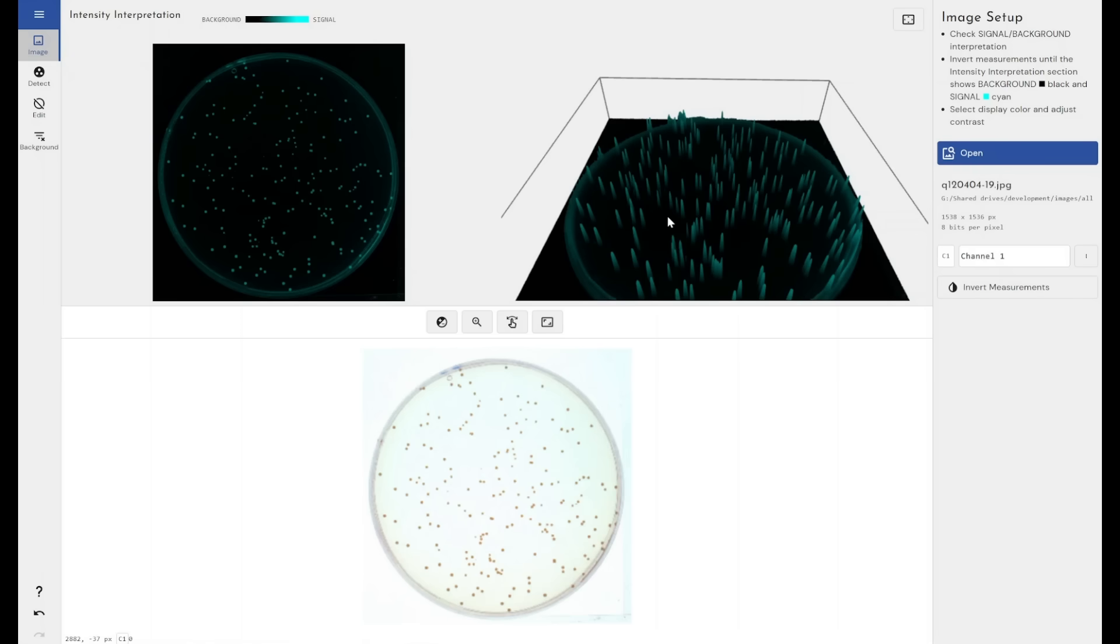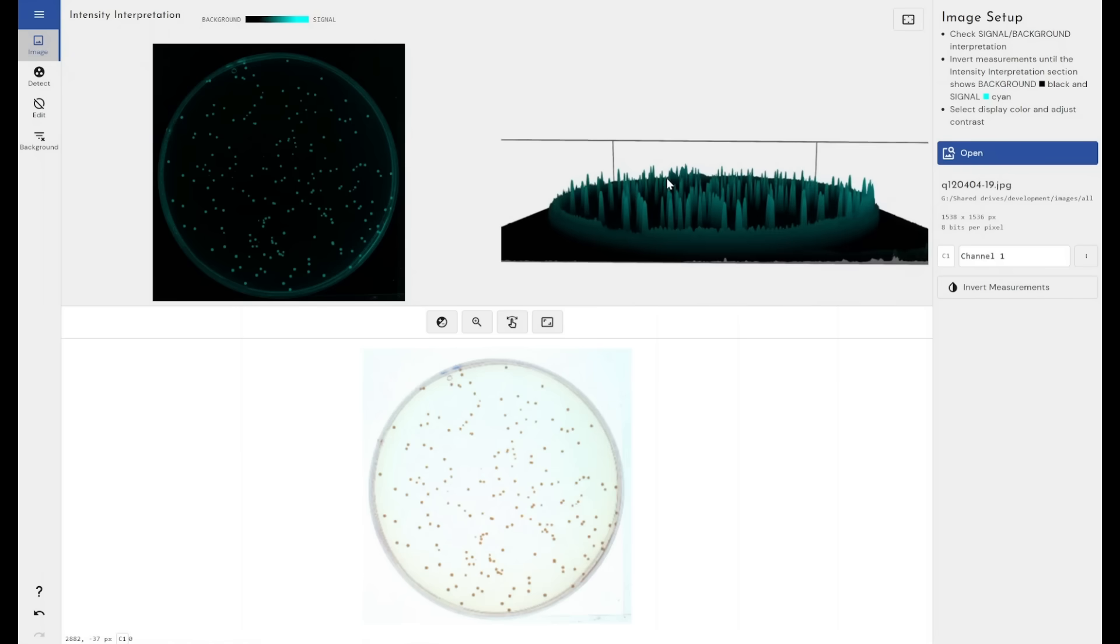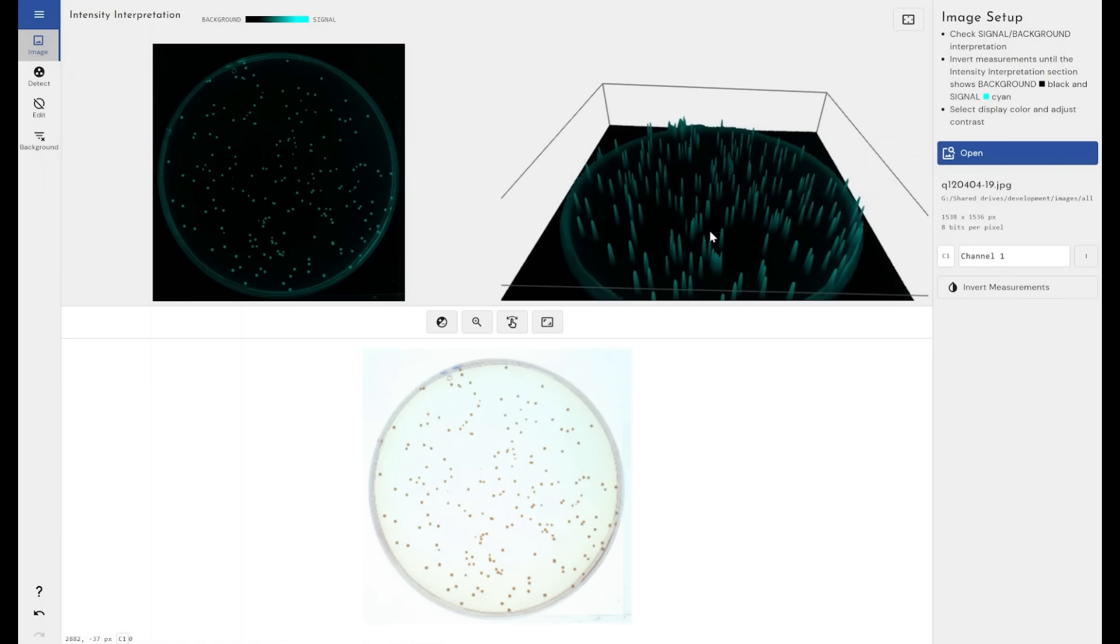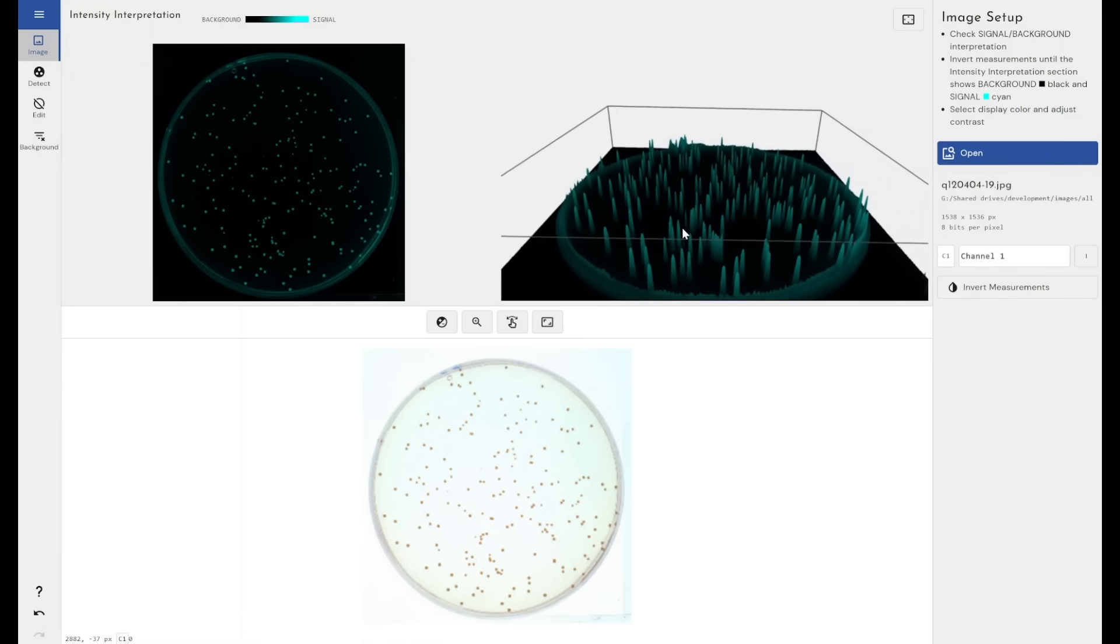We can see this in the 3D view here. The colonies that we're interested in counting and measuring are represented by these high peaks. The background is represented by the darkness behind them.